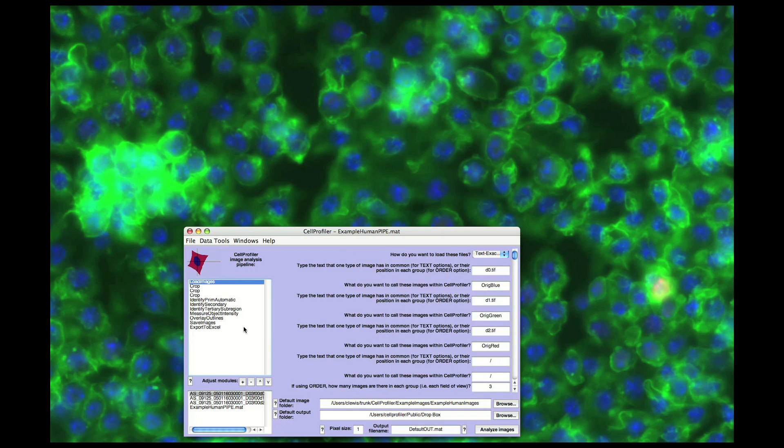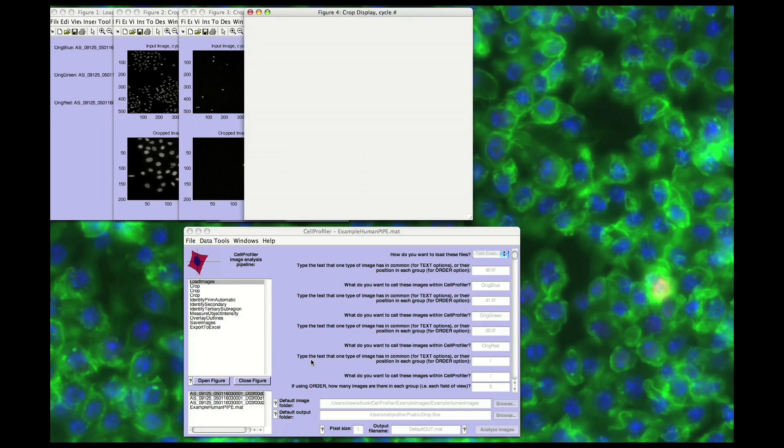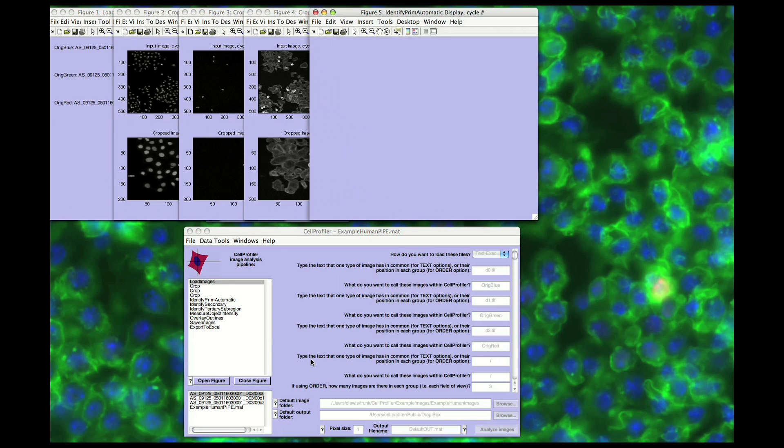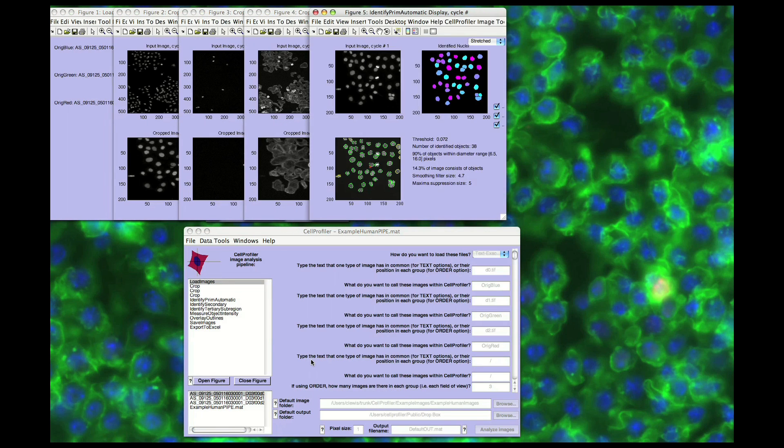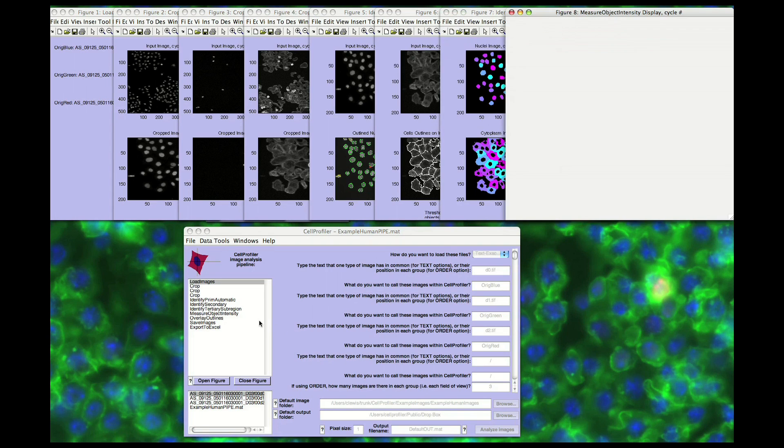Now, to actually execute the loaded pipeline, click on the Analyze Images button at the bottom right. As each module executes, a window is open so you can examine the performance of the module, its input as well as its output.